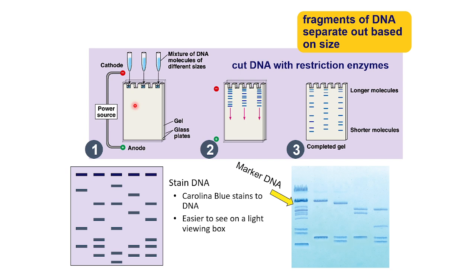Why is it so? What is this marker DNA made up of? This marker DNA is made up of several base pair sizes of DNA material. What does that mean? The marker DNA is nothing but a molecular weight indicator. What does it indicate? It comprises several sizes of DNA put in a particular sample.